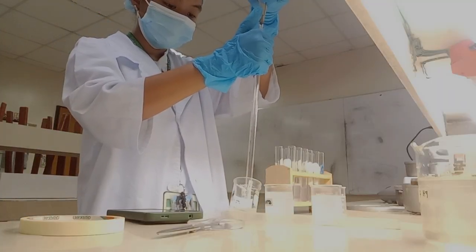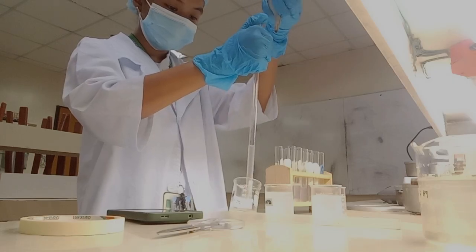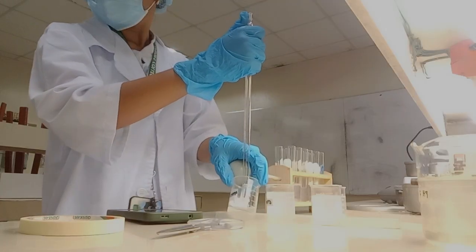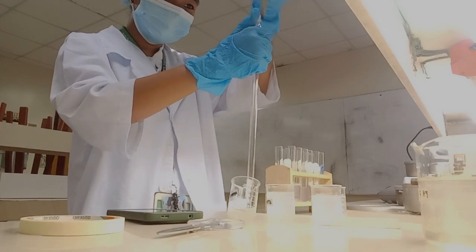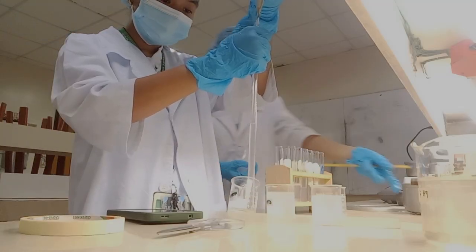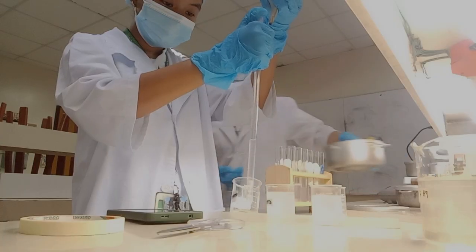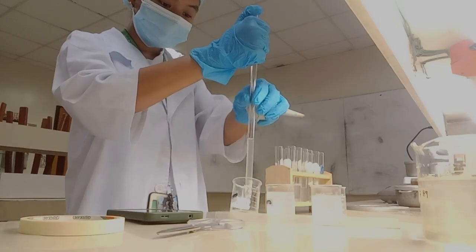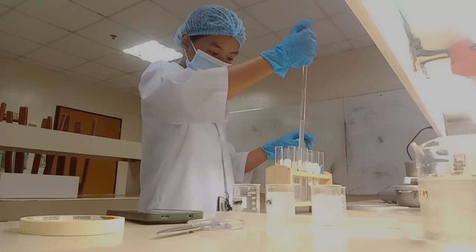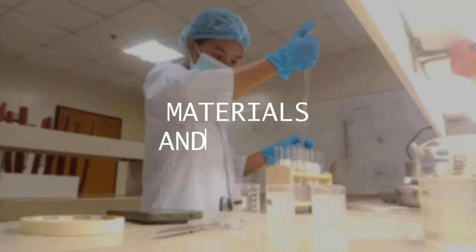The objectives of this experiment are, first, to measure salivary amylase activity through starch digestion time. Second, to determine how temperature and pH affect enzyme activity. Third, to analyze the effects of substrate concentration on reaction rate. And fourth, to relate the findings to digestive physiology.